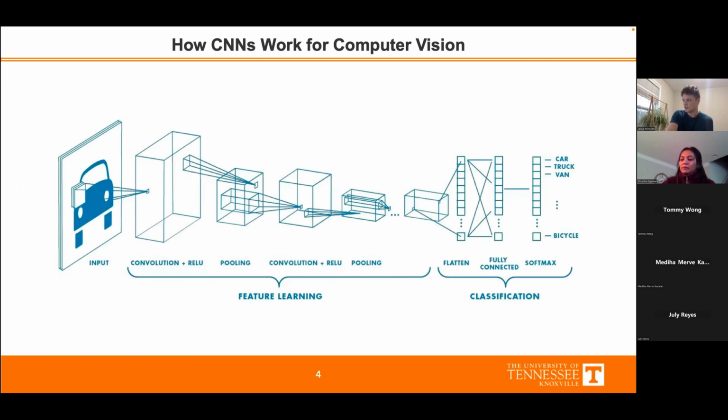And then this is just a schematic that I found online that kind of explains how the architecture would work. This is just a very general interpretation where you have your actual image. It breaks it down into subsets of pixels before passing through convolutions, activation functions, pooling, your fully connected layer, and then getting your statistical outputs, or the probability that it is a specific object and where exactly it may be located.